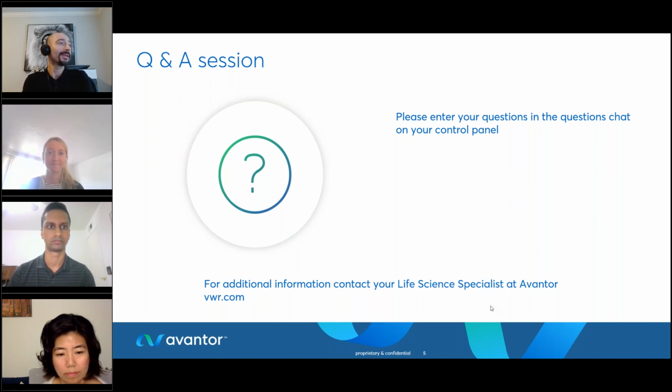Great, thank you. The next question again is for you, Sarah. So does the downsampled reads used mean the rest of the reads were discarded? So for example, if there were 9,000 raw reads, the downsampled was 200. Does this mean that 8,800 were discarded? So yes, this is the case.